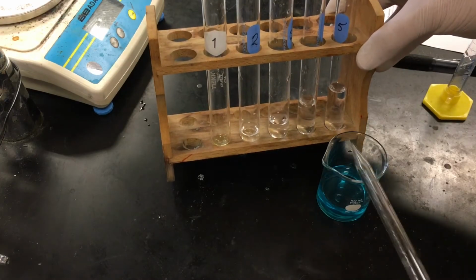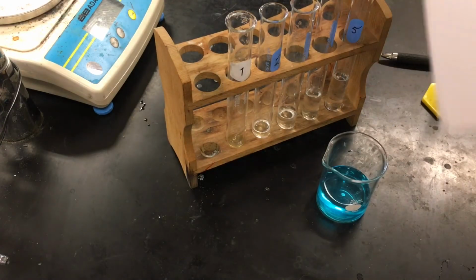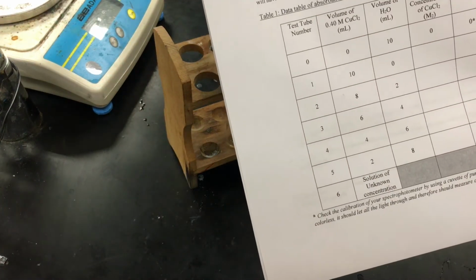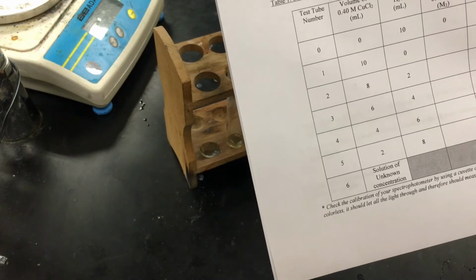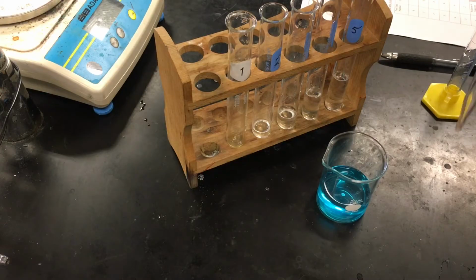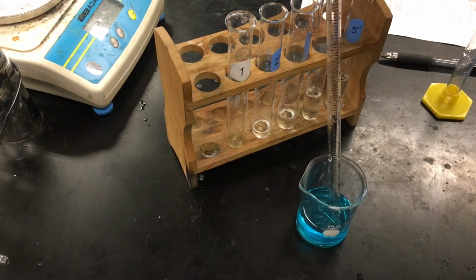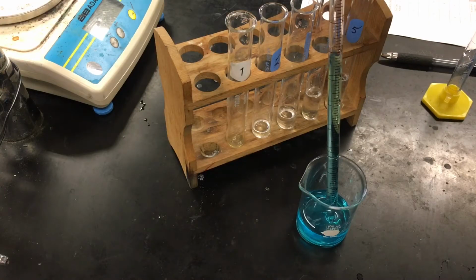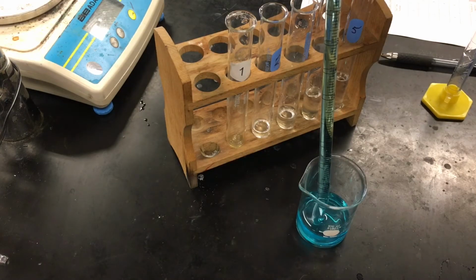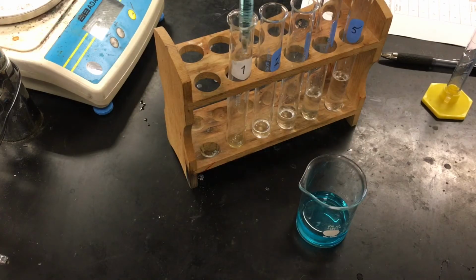So now we're just going to add the copper chloride solution, and we're going to follow the lab handout over here. So in test tube number 1, 10 milliliters, and then 8, 6, 4, and 2 in the other test tubes. So we have 10 milliliters in the first test tube.